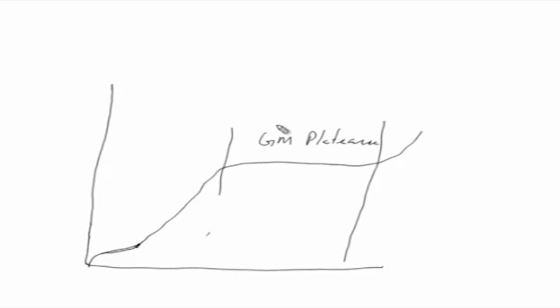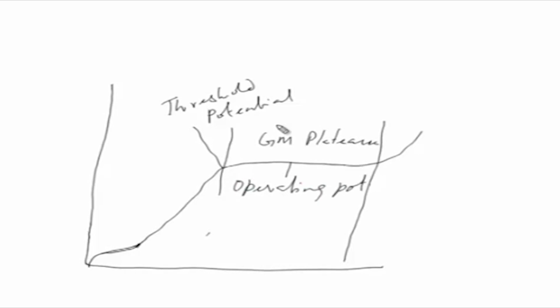Here you have a threshold potential, and somewhere in the center is the operating potential, where mostly the GM counters will be operated, and further along is the point where continuous discharge occurs. Before that is the breakdown potential.